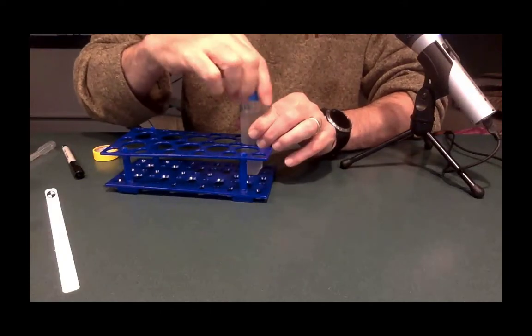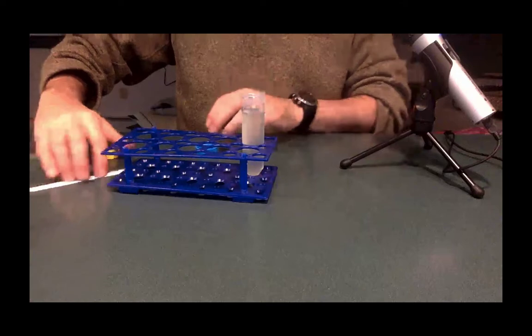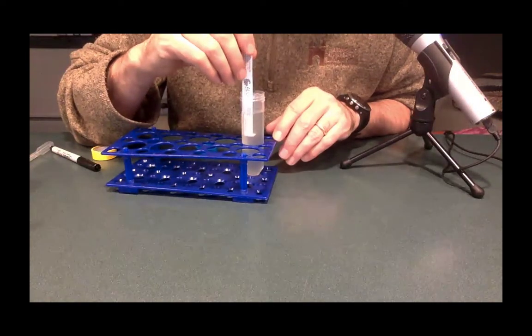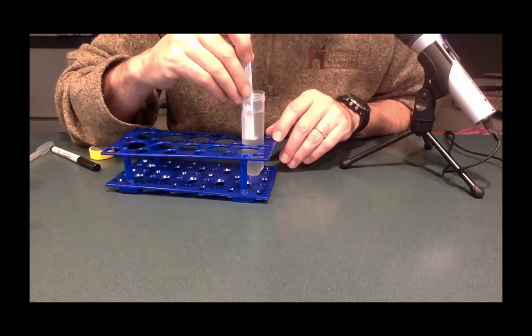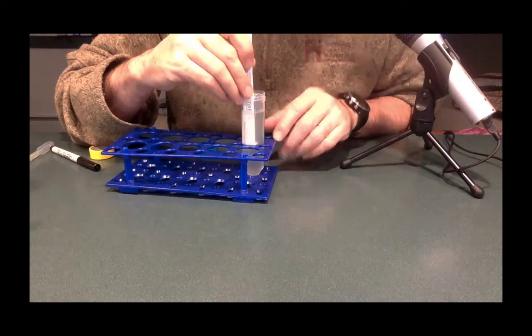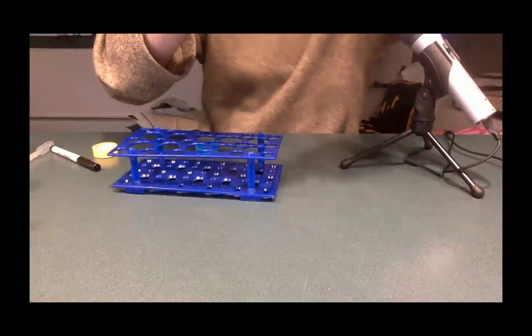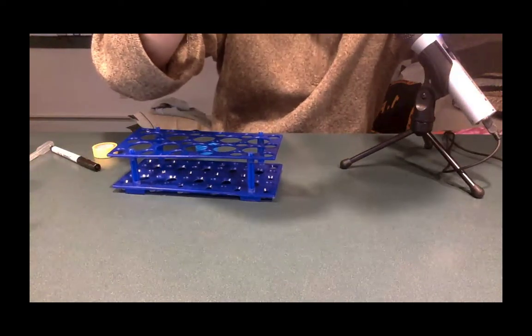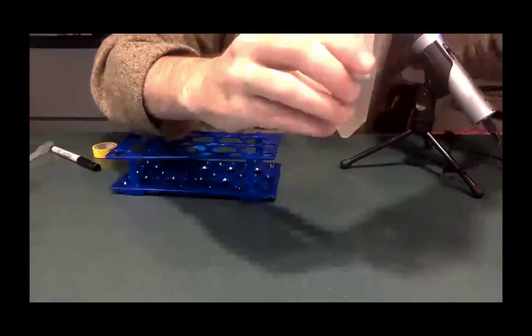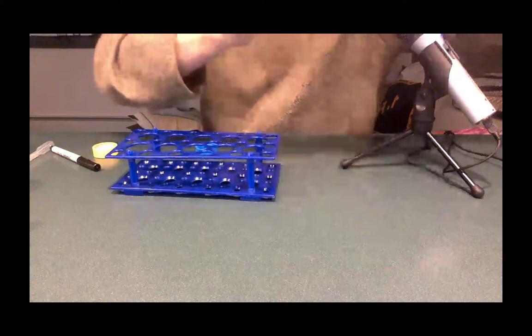And then what I'm going to do is I'm going to now use my mini Secchi disc, and I am going to drop this down in here until I cannot see the little black and white lines on here. And so what I've done is I've dropped it down to a certain point, and what I find is that when I do that, I will then see a level at which I can see this, and it gives me a distance of 40, I'm going to say this looks like it's a 43.